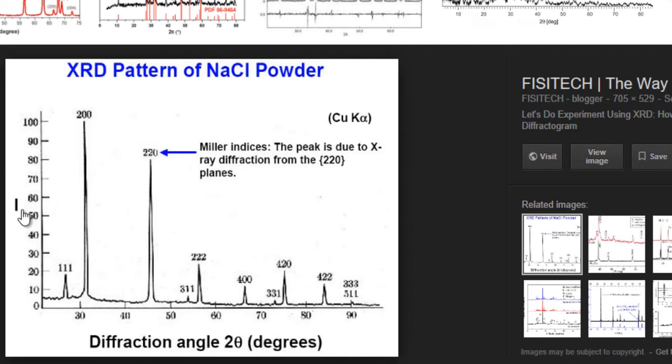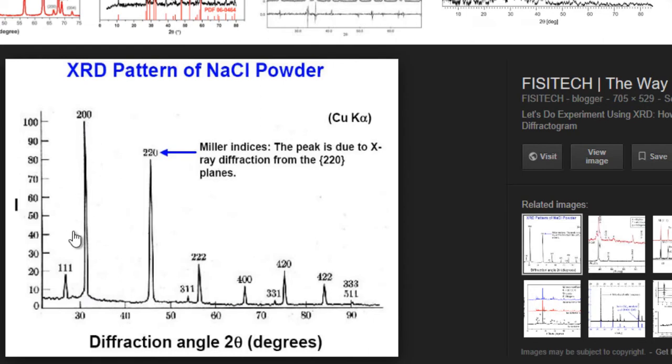Then you have the peaks, the XRD peaks, and the labels for these peaks given in terms of the HKL planes, that is Miller indices.